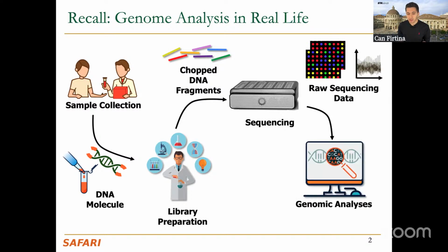Then we have this raw data that is generated by sequencing machines, based on how these machines are designed and the technology that they are using. Some machines will generate image data, some will generate raw electrical signal, simply because of how these machines operate at the lower level. Then we analyze this raw data, usually by first translating it to ATGCs using a computational step called base calling.